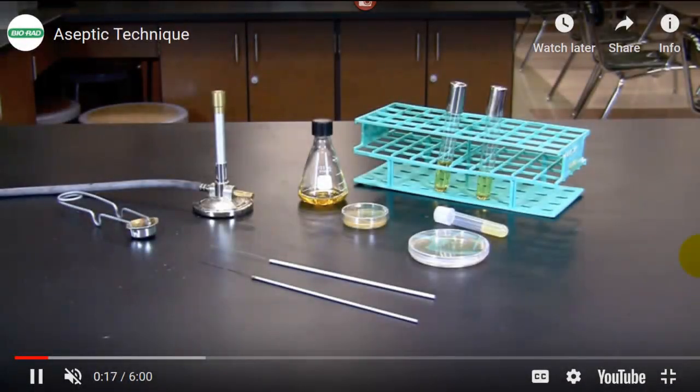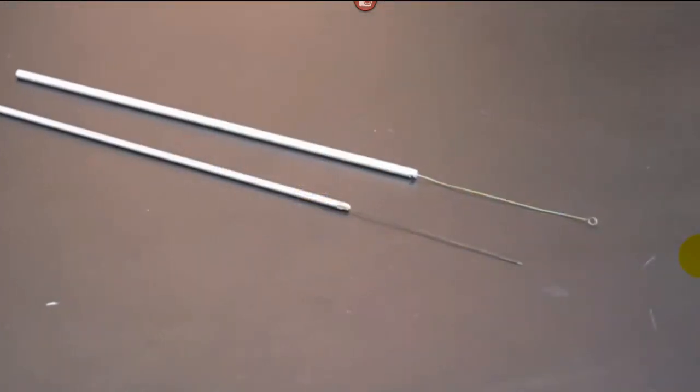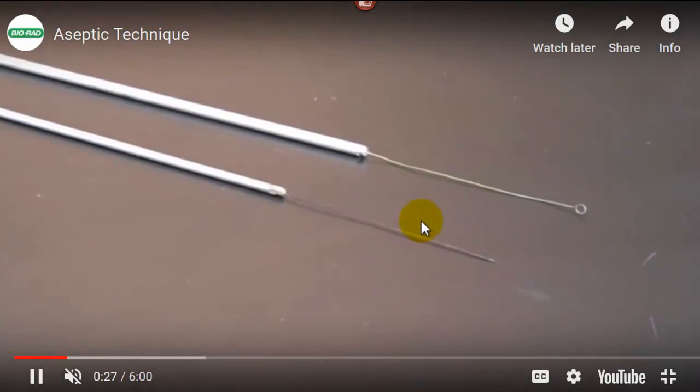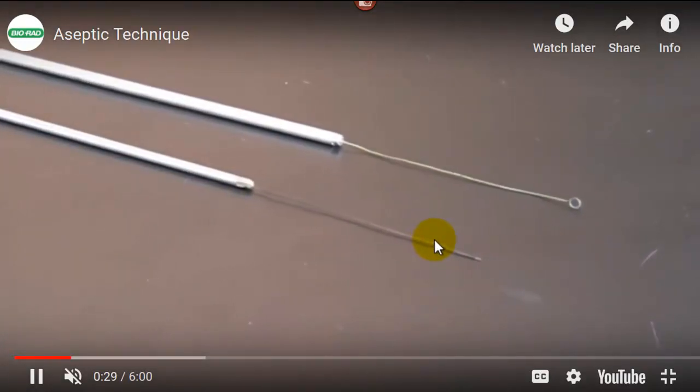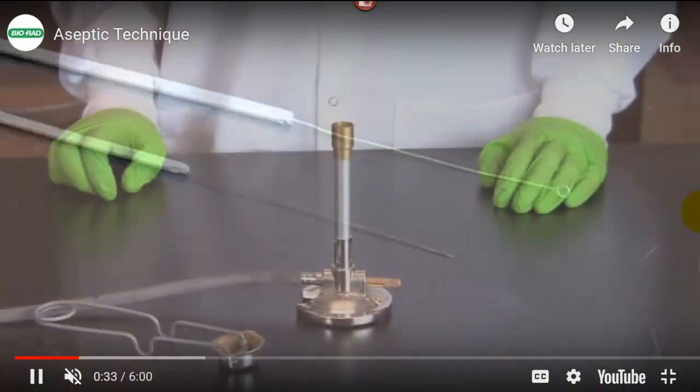Next, we are on to a company called Bio-Rad. We actually purchased their bioluminescent pGLO kit. Here is an agar slant. This is actually just a needle, it's called, that you stab agar with microbes on the end.